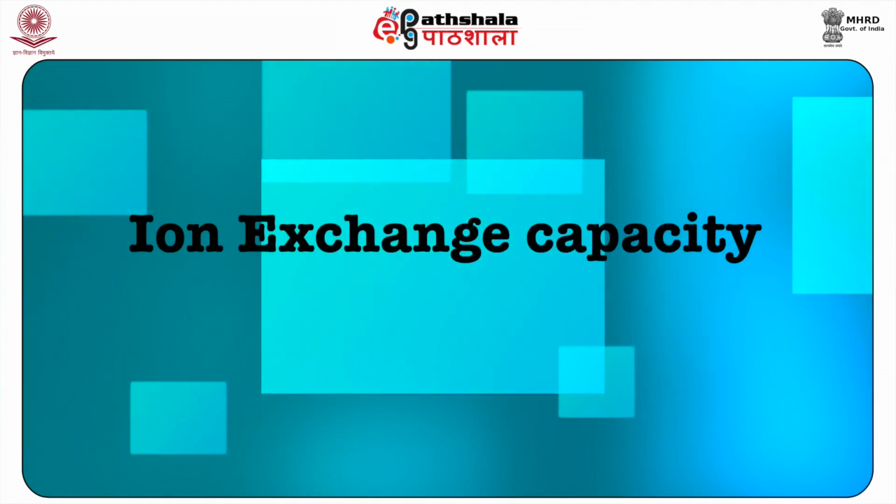Ion exchange capacity. The ion exchange capacity of a resin may be characterized by the number of ion active groups.